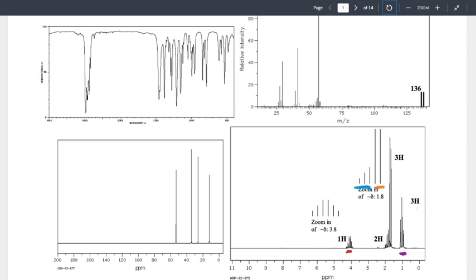I'll give you 5. Oh, I thought it was... Oh, my bad. Then yeah, I'll give you that. So blue, a 5. Okay, that one I would argue is the harder one. The orange one is why I picked orange, because I think it's a little bit easier. And that orange one, those 2 tall peaks are really, really tall and standing out. That's like the 2 peaks that we had here. They stand out away from each other. That's getting us our 2 peaks.